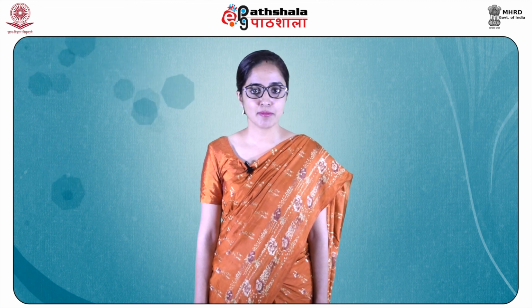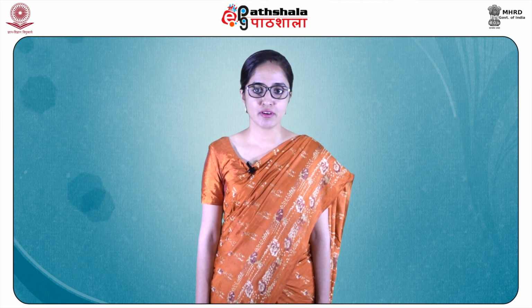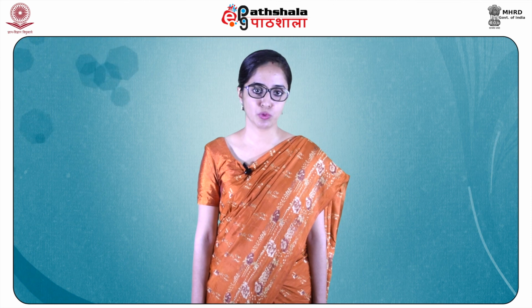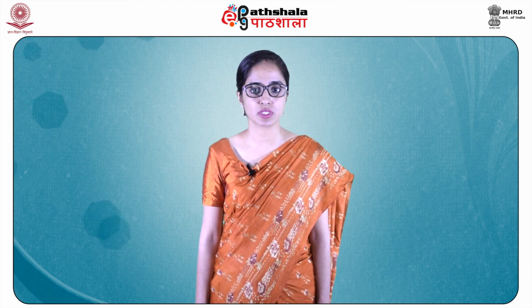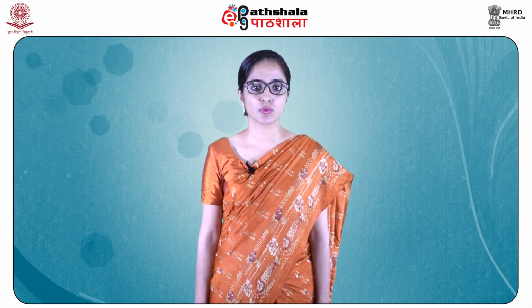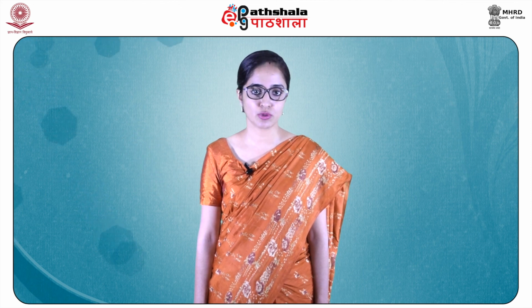The vaporized sample is ionized by bombardment with a beam of high energy electrons, usually 70 electron volts. The initial step involves the evaporation of a small amount of compound, followed by the ionization of the vaporized sample by bombarding it with a beam of high energy electrons, generally 70 electron volts.